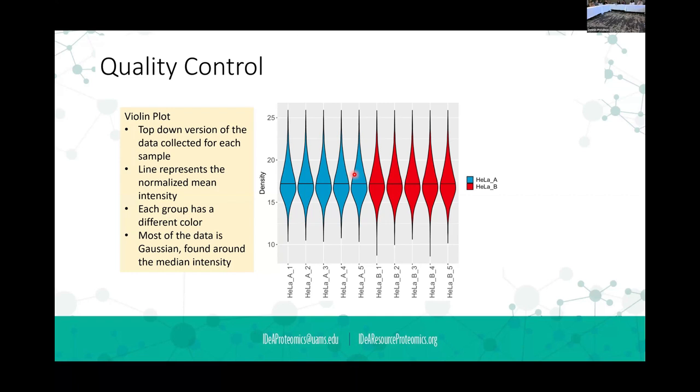It can also be that the initial protein distribution can be wrong. The solubilization can be wrong. Yeah, that's why we call these quality control, because they will indicate problems. It's like you've got cars, they have these little indicators, and that little red light comes on.